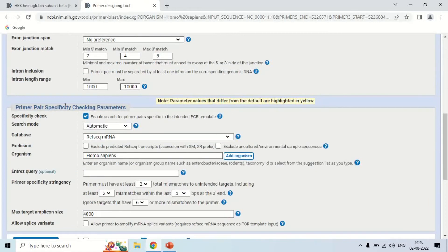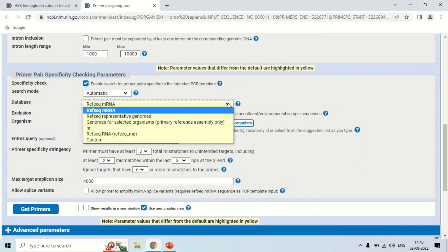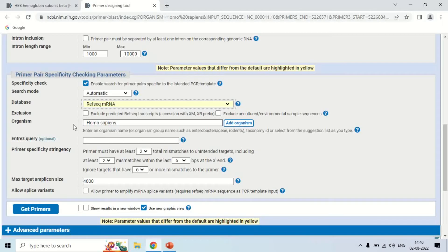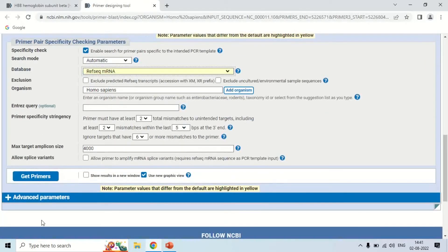An important section is the pair specificity checking parameter — check it carefully. It shows which database is selected; you can change the database here. The reference RefSeq mRNA database is currently selected, and the organism is homo sapiens. After checking this section, click 'Get Primers.'